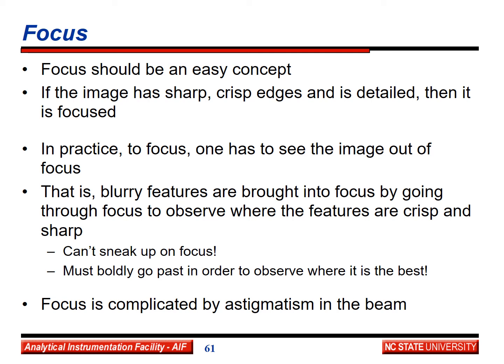This means that when you're turning the focus knob, you don't know if you turn it a little bit more that it's not going to continue to get better until it starts to get worse. Focus is complicated by astigmatism in the beam.